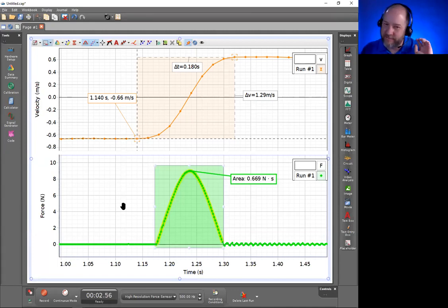Well, we could write this down on paper. We could type it in a corresponding Excel spreadsheet. In this case, I'm going to show you that we can actually use the table in Capstone to have some metadata to begin recording data about our data from sensors. So I'd like to add a table to my page. I want the table to be on the lower half.